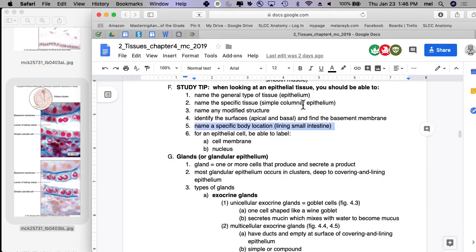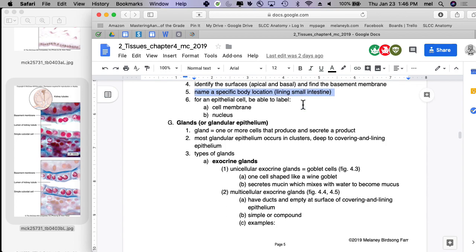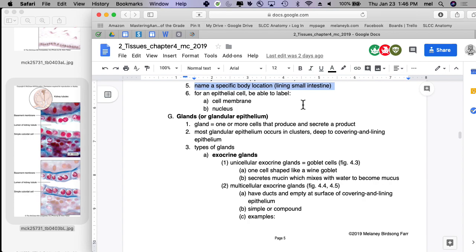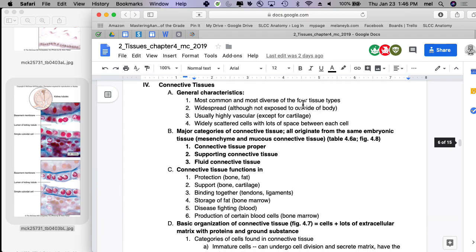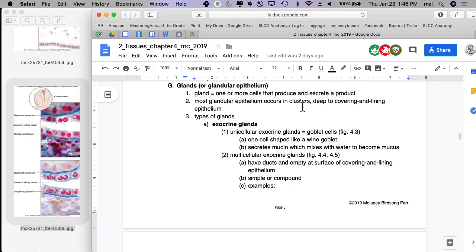And if you can do that, again, over multiple iterations of the same tissue, then you're kind of done with that epithelial tissue. And then you can move on. And I'll do the same thing for you with connective tissue, which is actually a little harder. There's a lot more to remember on connective tissues. Okay, and last tidbit before we move on to connective tissues is what about the histology slides that are epithelial tissues, but I don't make you memorize the slides because they're hard.